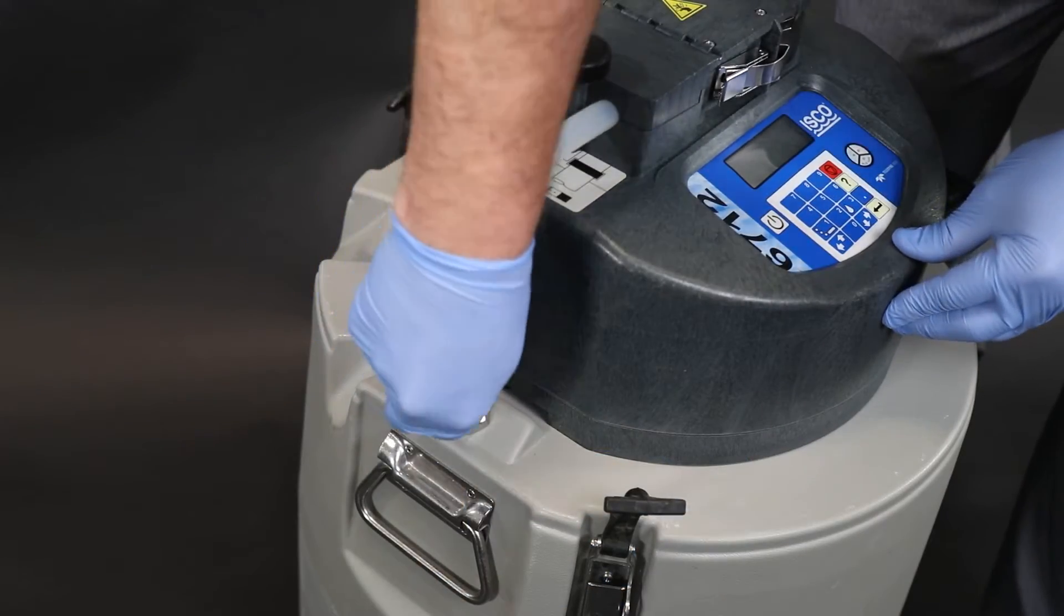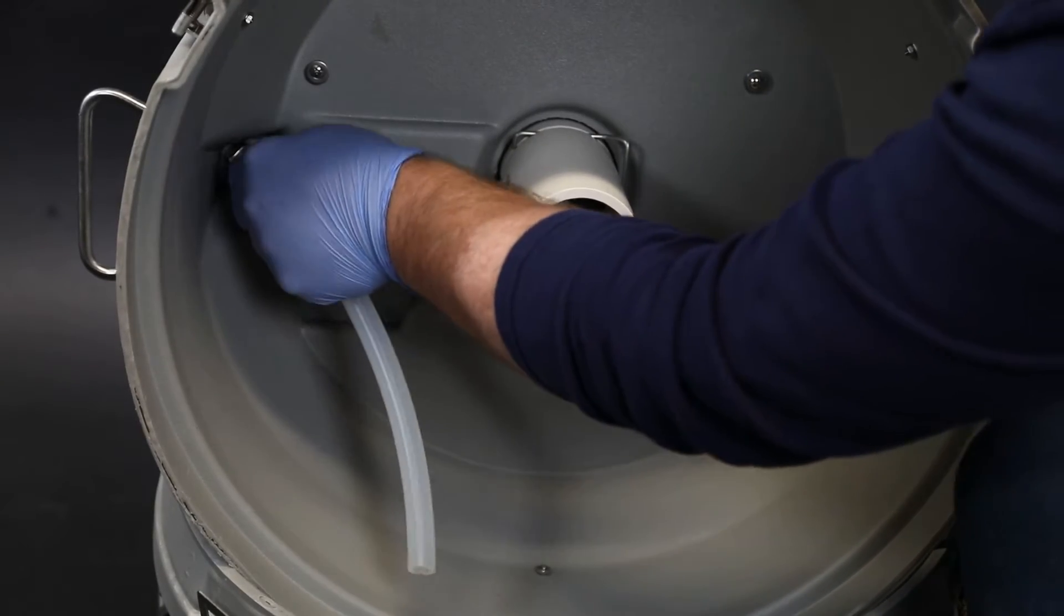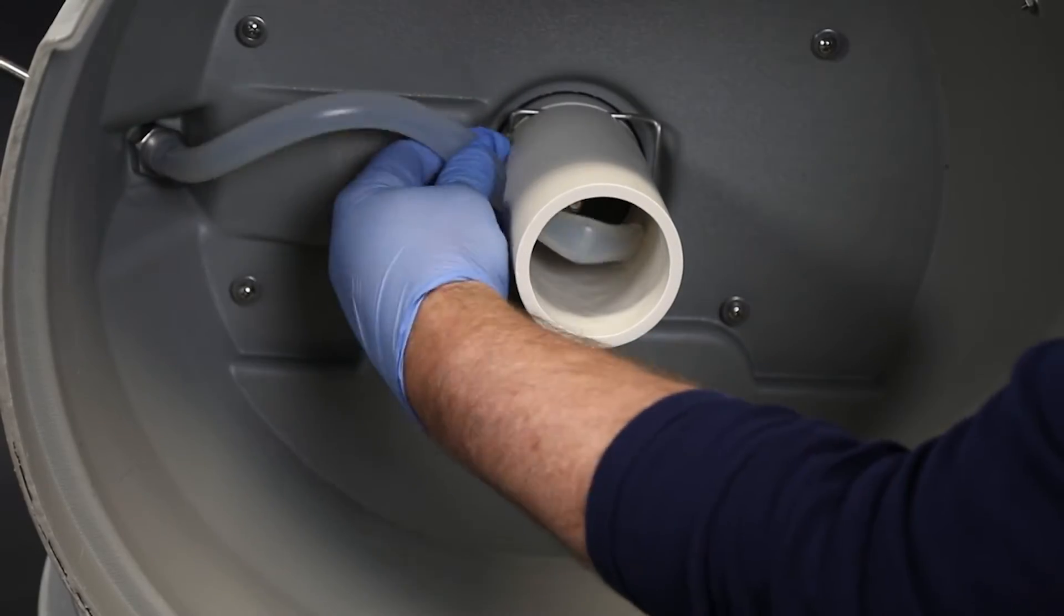Attach the long end of the pump tubing to the sampler. Inside the sampler, connect the discharge tube. Run the tube through the hole in the pipe and out the bottom.